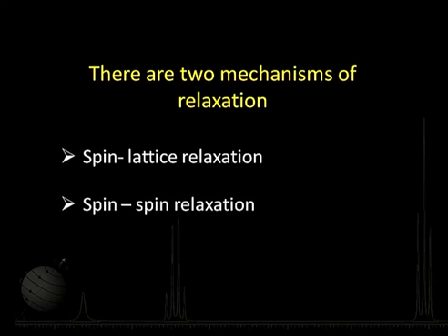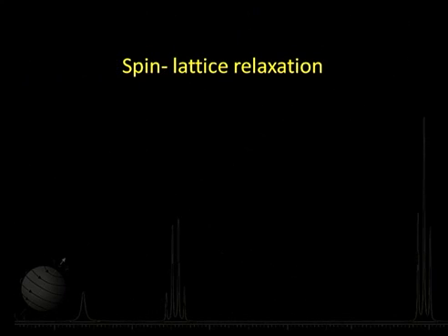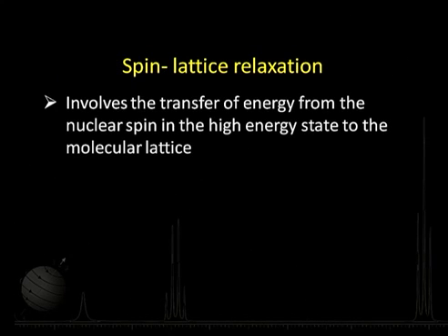Let's look at this, very simple ones there. Now, spin-lattice relaxation, as the name suggests, basically involves the transfer of energy from the nuclear spin in the higher energy state to the molecular lattice.